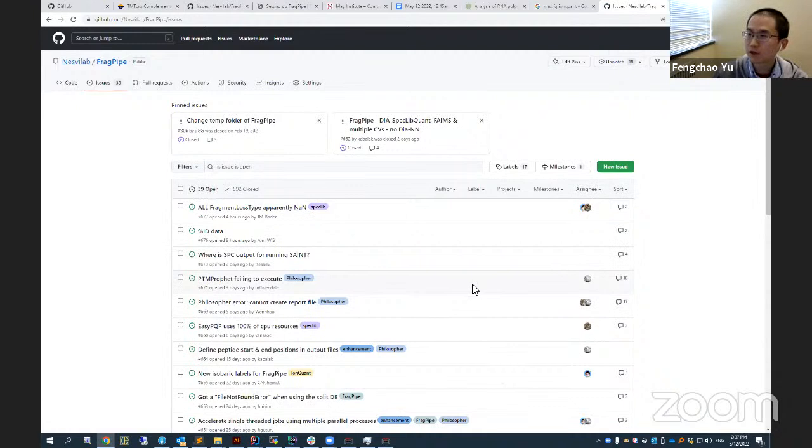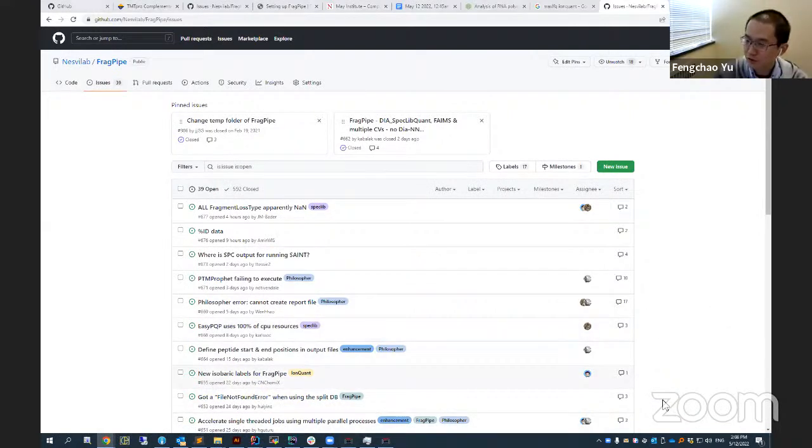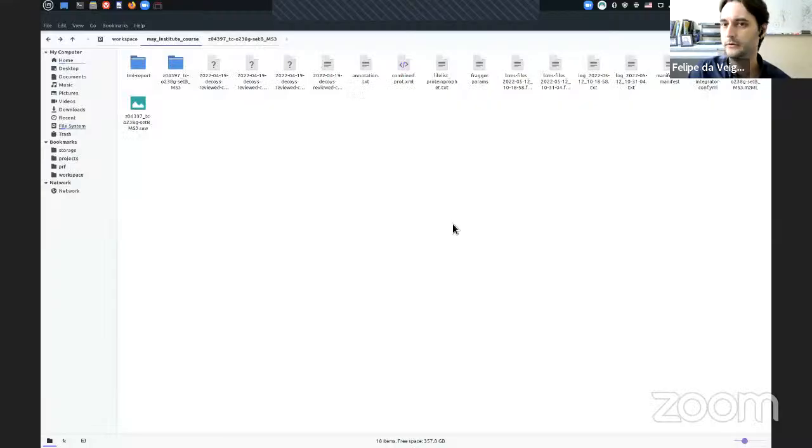So, okay, Philip, can you talk about the TMT result file? Now I think we only have half an hour left. I think we have time. Okay, I will let you. I'll stop sharing and let you do it. Let me take over. Okay. All right.